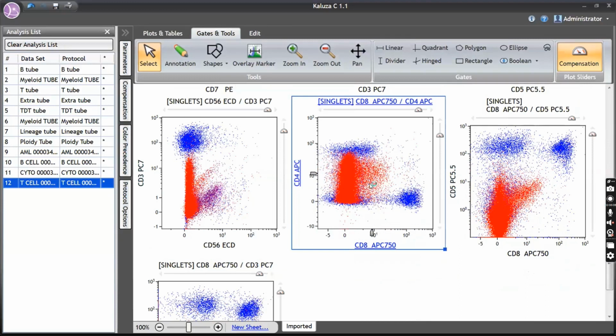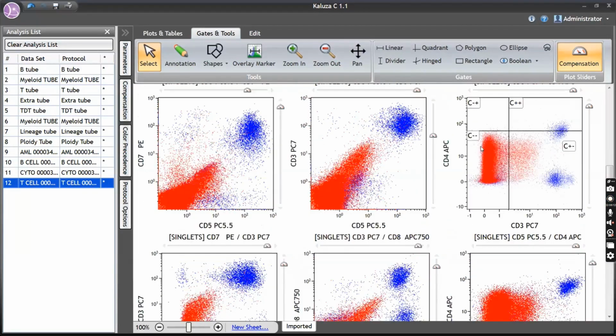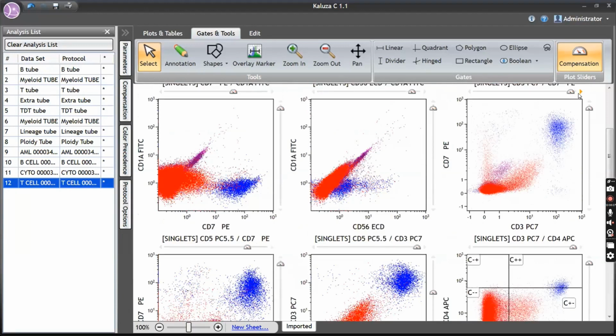You need to check that, because Ph positive ALL can show some myeloid markers. But again, this CD4, I don't know. Is it because APC is the culprit which is doing that? I don't know, because your internal controls are quite in place. Why so much specific signal in APC and CD4? That is one thing which is not fitting. Otherwise, I would be happy to sign this as B-ALL with aberrant myeloid markers because MPO is completely negative.